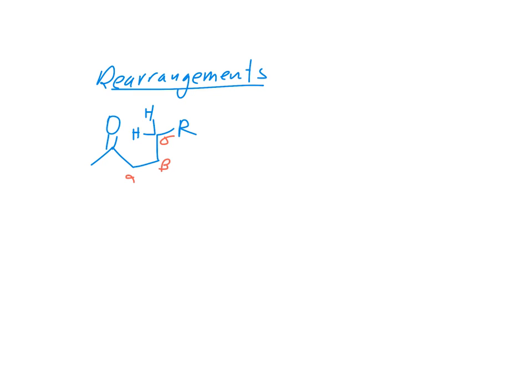Okay? So when a ketone like this is ionized by electron impact, it's going to ionize on the non-bonding electrons on the oxygen. I'm going to draw that so we'd have a molecular ion that looks like this. The first thing that can happen in this pathway is that a hydrogen atom at that gamma position gets transferred to the oxygen.